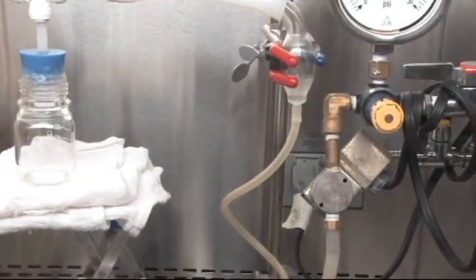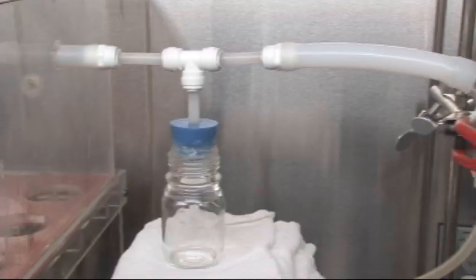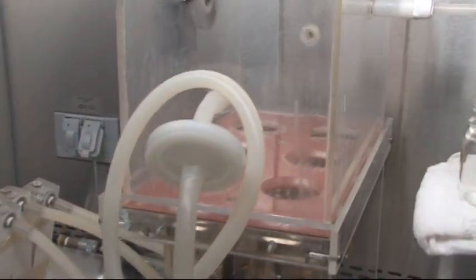A nebulizer is used to create an aerosol of bacillus atrophia spores. The box is hooked to a vacuum which draws the spores into the sample materials.